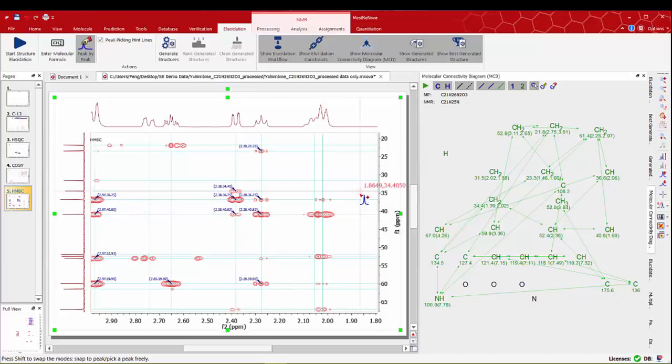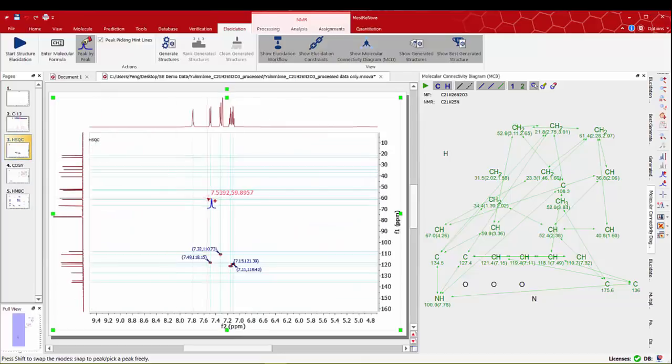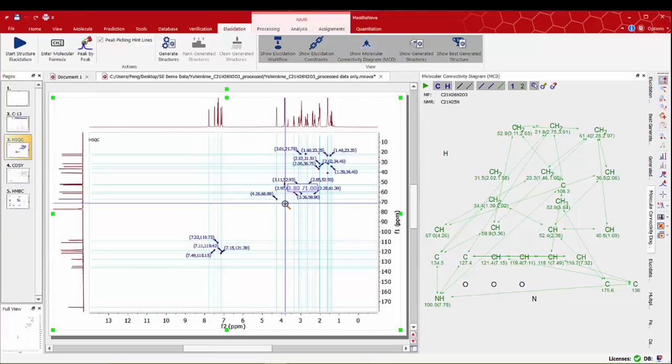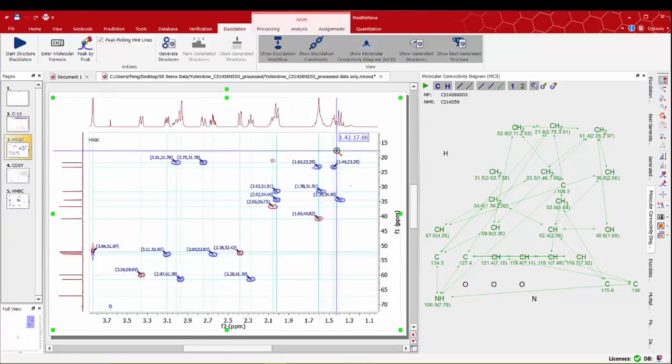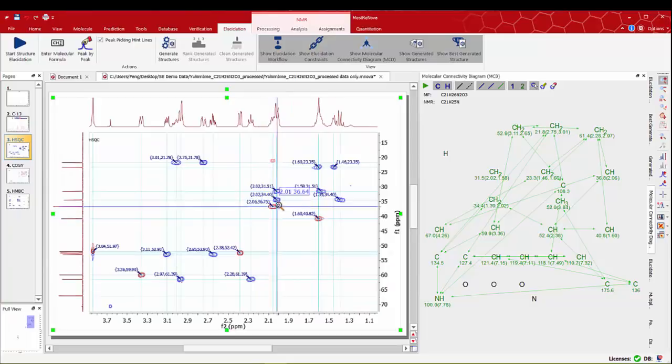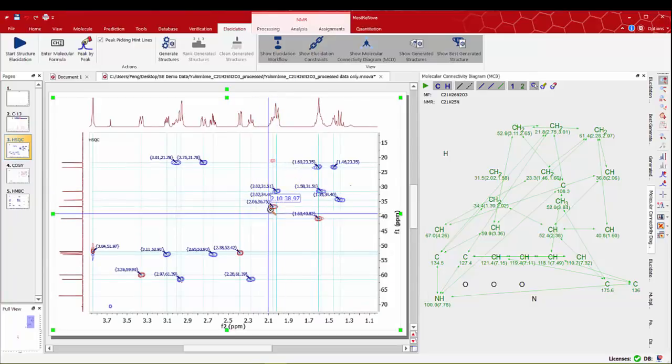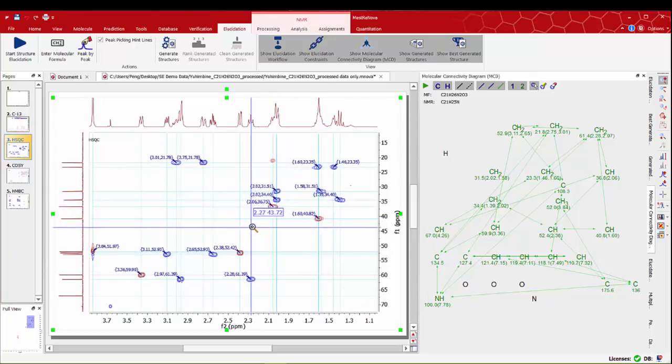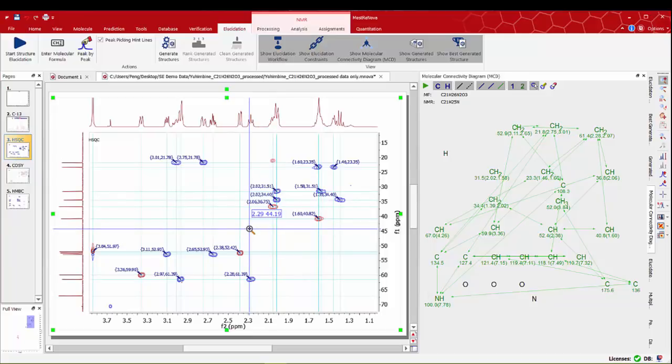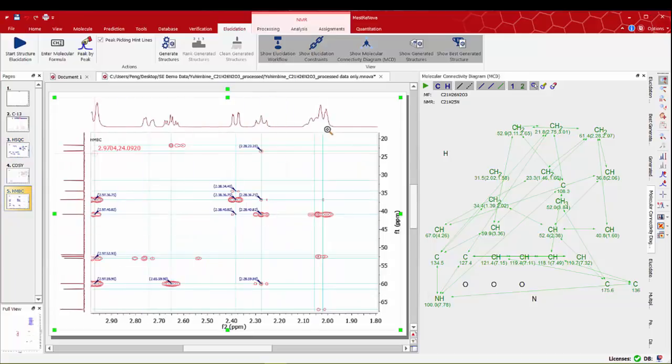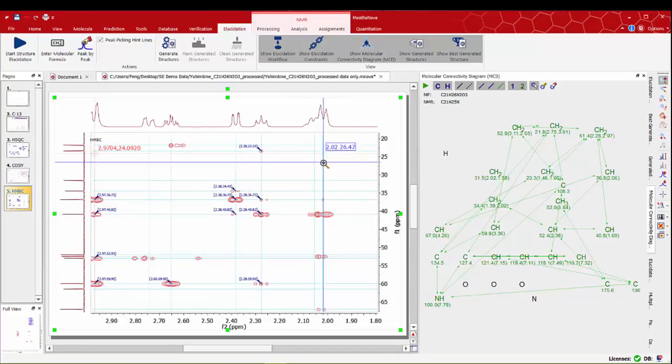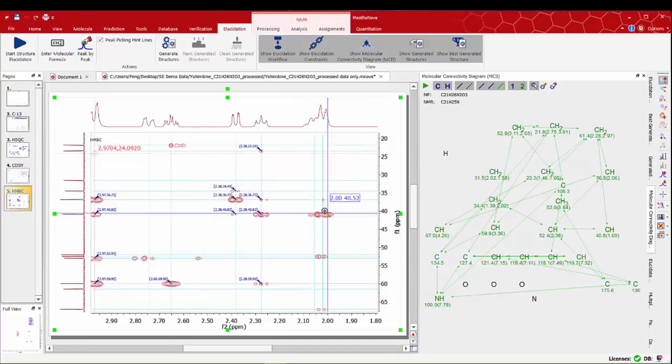We have to be careful with the group of protons around 2.02 ppm. Double checking the correlations on the HSQC spectra we can see how these groups can be problematic at least two of the protons are totally overlapped. In this case better to ignore all correlations for these groups of protons on the HMBC spectra.